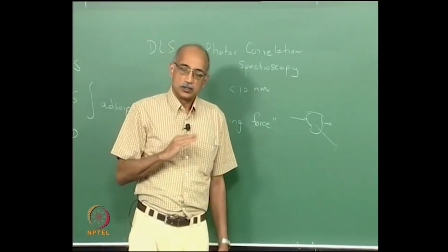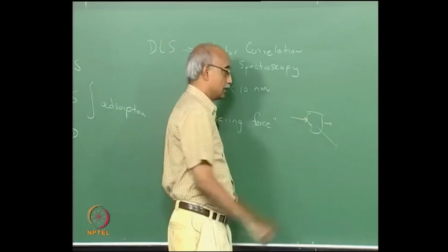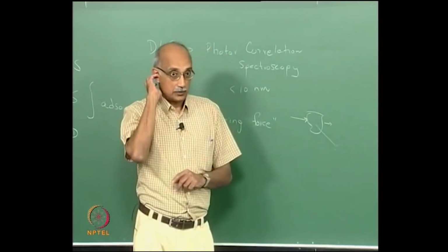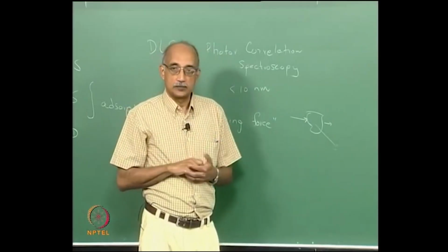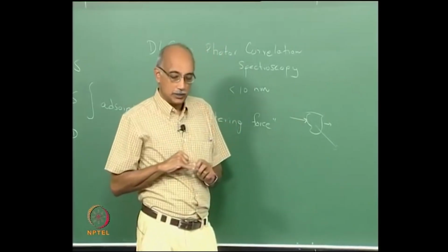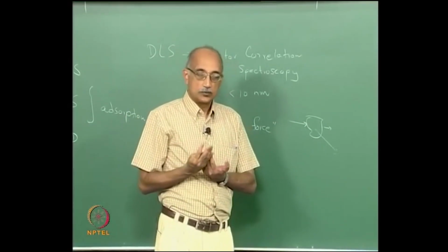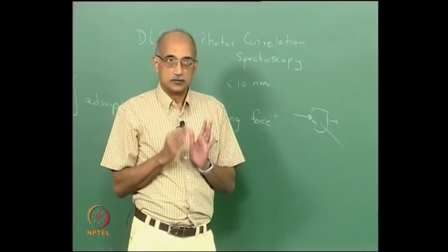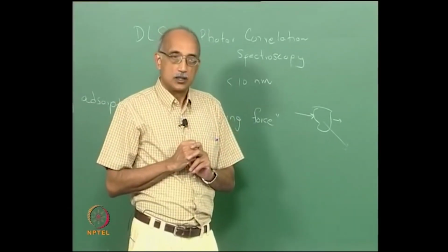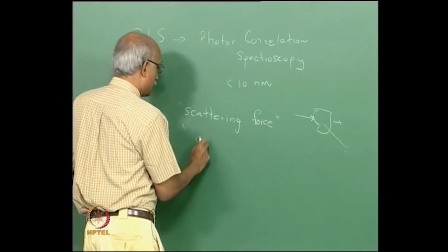So, what this means is that your assumption of a particle that is being held static for you to analyze it is being violated. So, the way you handle this is actually by providing an equal and opposing force that will position the particle where it is. The way you do that is essentially by providing what is known as a gradient force.